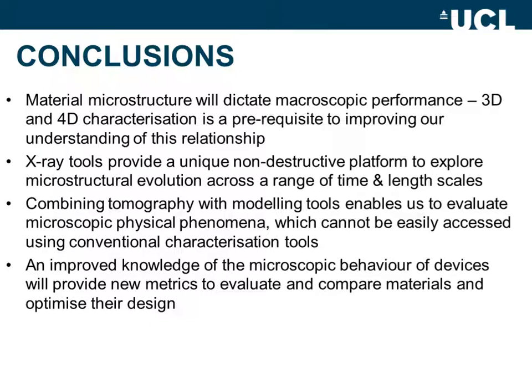So to conclude, in batteries, there are many time and length scales and heterogeneities that occur across all those time and length scales. X-ray tools, I think, provide a unique, non-destructive platform to explore these microstructural evolution effects. But by combining non-destructive tomography with focused ion beam slice and view, with helium ion microscopy, as well as with the spectroscopy tools that we're used to as electrochemical research scientists, we can gain an improved knowledge of the microscopic behavior of devices, providing new metrics to evaluate and compare materials and optimize their design.